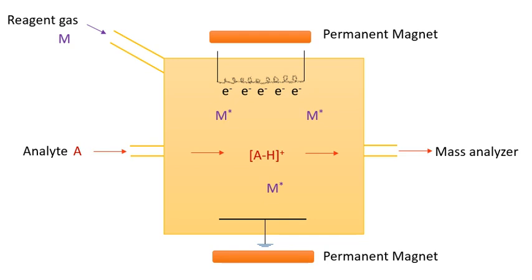Topic: Atmospheric pressure chemical ionization. Chemical ionization in an atmospheric pressure electric discharge is called atmospheric pressure chemical ionization (APCI), which usually uses water as the reagent gas. An APCI source is composed of a liquid chromatography outlet, nebulizing the eluent, a heated vaporizer tube, a corona discharge needle, and a pinhole entrance to 10⁻³ torr vacuum.